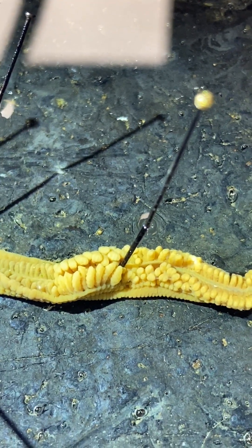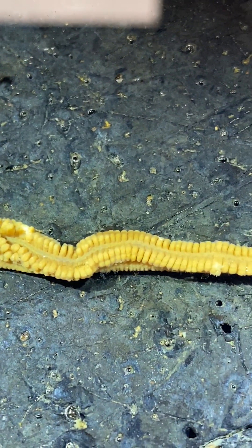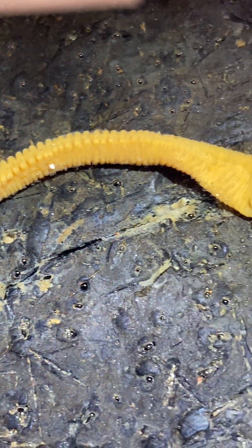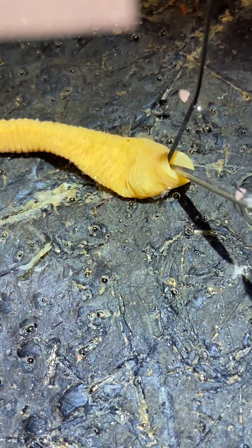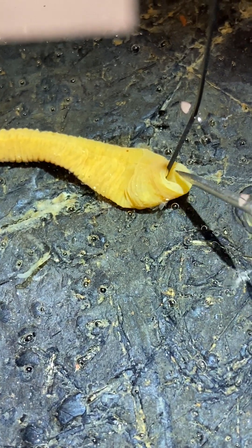Posterior to the hepatic region is the intestinal region of the body, which starts about here and runs the entire length of the rest of the body to a terminal anus. This pin is holding the posterior end in place, and this opening here is the anus.